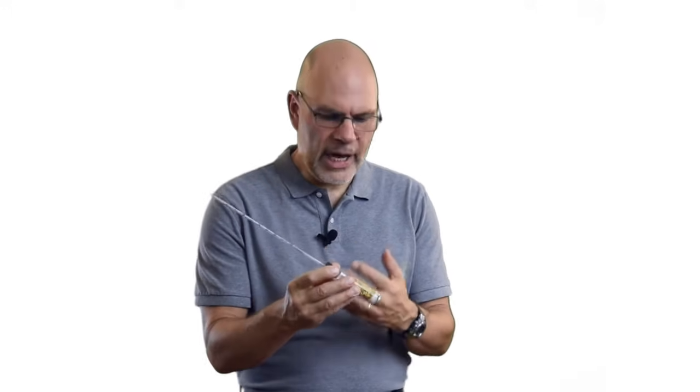So now that you know how a respirometer works, you can do all kinds of inquiry. Think about different variables, like different types of seeds, or how long it's been since they germinated, or using different kinds of organisms all together. In every case, you're going to think about how to test those variables, and you're going to have to design an experiment with adequate controls. I'm going to leave that to you.